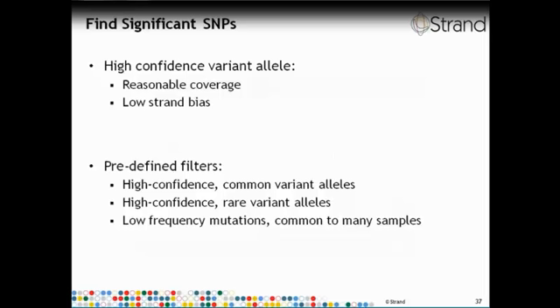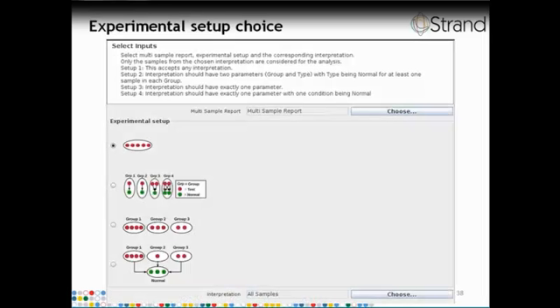Similarly, a user may be curious what would happen if the number of supporting samples were changed from 48 to 60, in which case we would consult the colors shown here and say that if you were interested in supporting reads in the 35 to 100 range, but only in those alleles which have support in at least 60 of the 96 samples, then we would add up these two colors here and say that the number of alleles would probably be around 170.